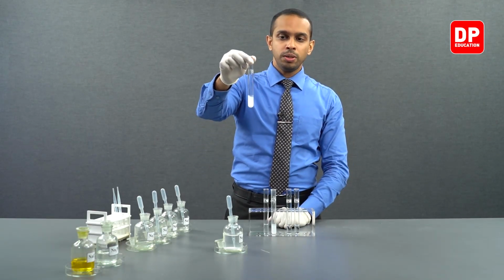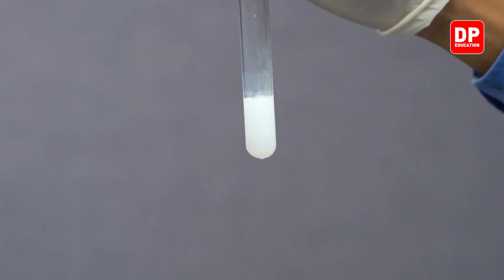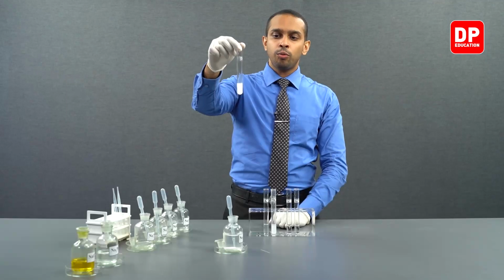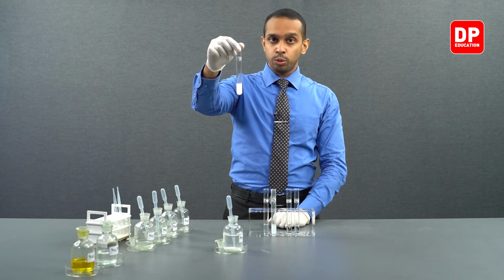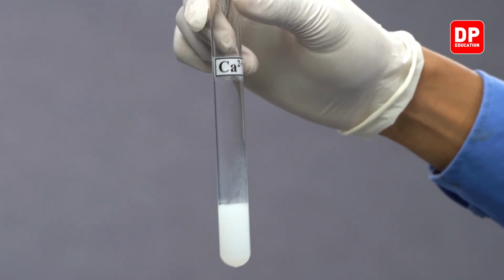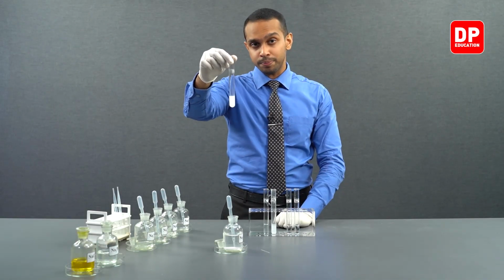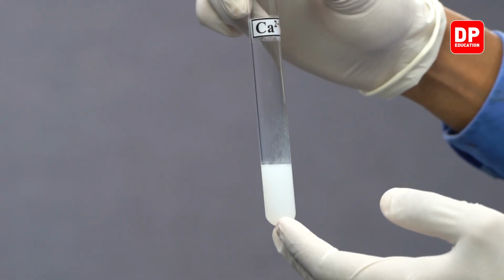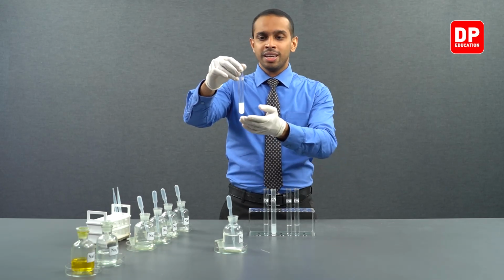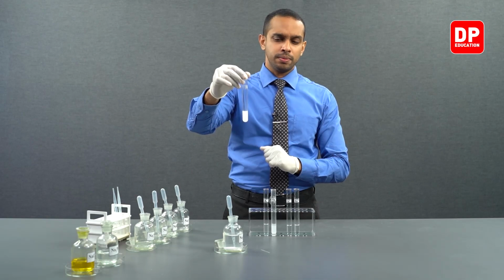White color precipitate formed. If you shake it, you will see the precipitate will get dispersed throughout the aqueous medium and make it look like a white color solution. But in fact, what you have here is calcium oxalate precipitate particles suspended in the aqueous medium. So calcium 2+ ions in the presence of oxalate anion form calcium oxalate, which is a white color precipitate.